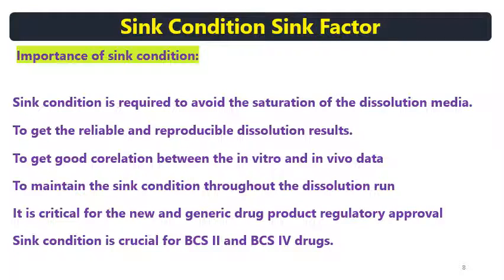Now we'll see what is the importance of sink condition. As we know, sink condition is required to avoid saturation of the dissolution media, and to avoid the chances of dissolution failure and incomplete dissolution. It is also required to get reliable and reproducible dissolution results, and to get a good correlation between in vitro and in vivo data.